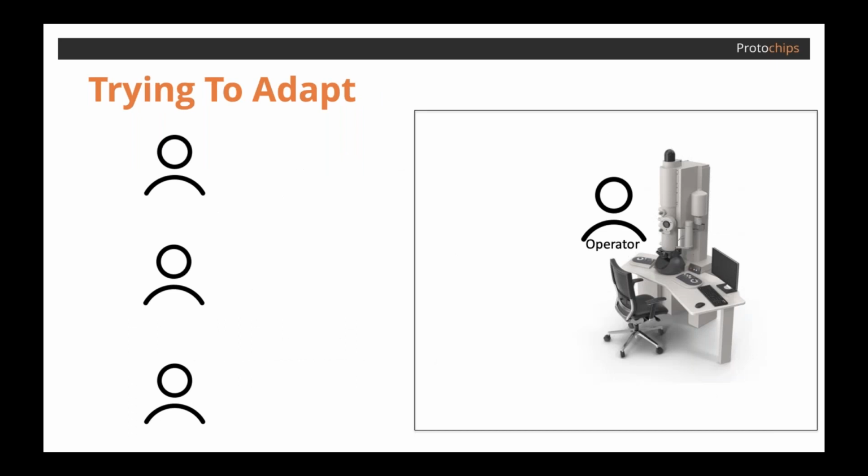In trying to adapt, a lot of the TEM core lab facilities are doing their best to give customers an experience that best replicates being in person, and they're doing this by using different remote platforms. With so much technology these days, such as Skype and Zoom and Teams, you would think that remote sharing a TEM session should be pretty straightforward, but it's not. Many core labs have regulations in place to keep their TEM safe by keeping it isolated from the internet. With no connection to the main TEM, that whole idea of straightforward remote sharing and remote collaboration takes a downturn. So now what do you do?